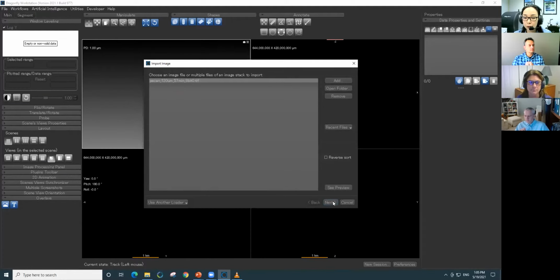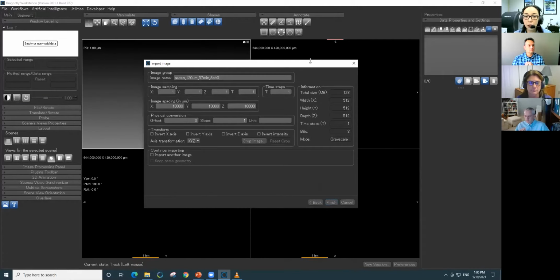And then once you open this and go to the next screen, you see a lot of parameters you can set here, but the important parameters are those three: X, Y, Z image spacing, a voxel size, in other words. So you got this one right. You need to know what the voxel size is when you're loading a general scan. And for this one, it is 120 microns. So let me just type 120 in. And the fact that you can specify X, Y, Z voxel size or dimensions separately means that the voxel does not need to be a cube, but usually it's cube shaped.